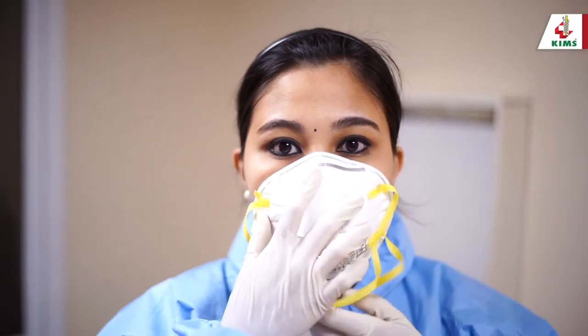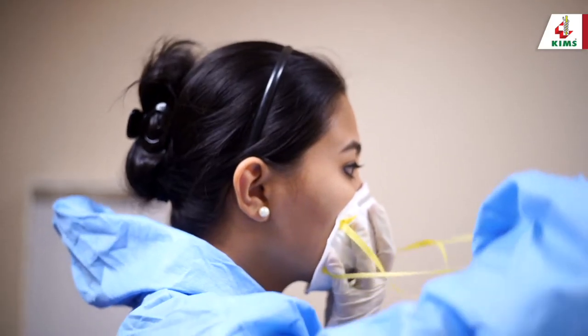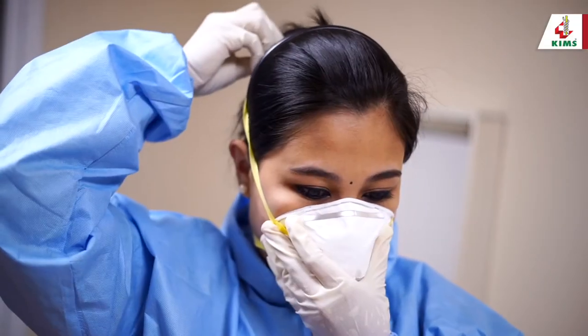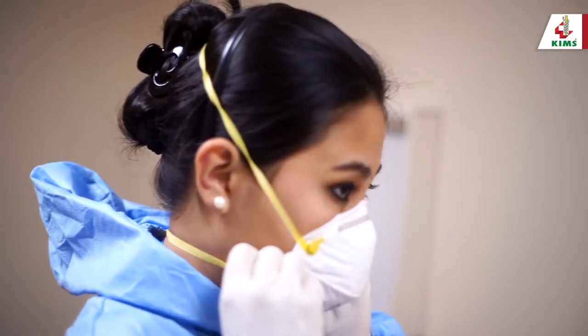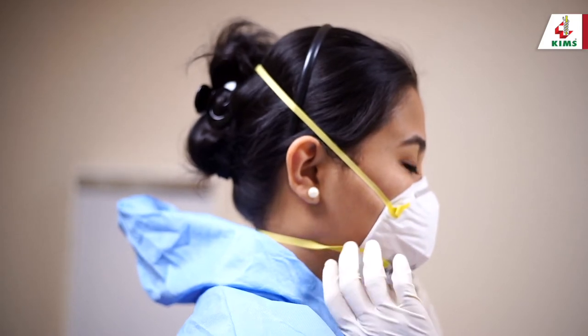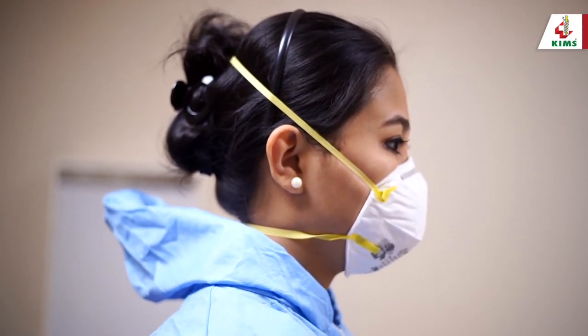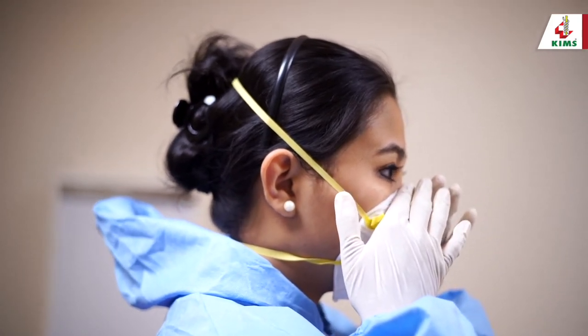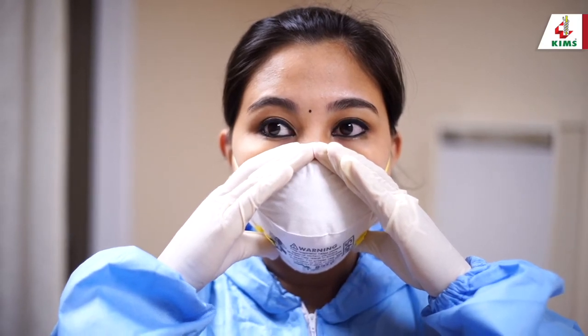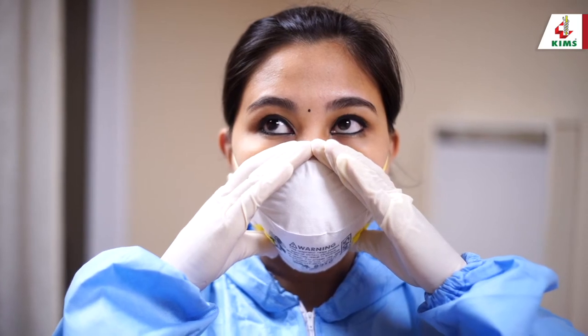Next, wear the N95 mask. Cup the outside of the respirator in your dominant hand with the straps hanging down. Bring the respirator to your face and place it snugly over the nose and mouth. Secure the lower strap around the back of your neck under the ears, and the upper strap behind your head above the ears. Adjust and approximate the pliable upper margin. Perform the seal check: cover the respirator with your hand and inhale deeply and quickly — it should collapse slightly inward. Then exhale with hands over the margins to determine if there are leaks around the mask.